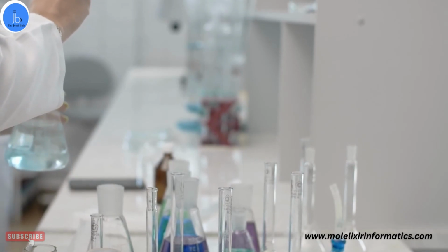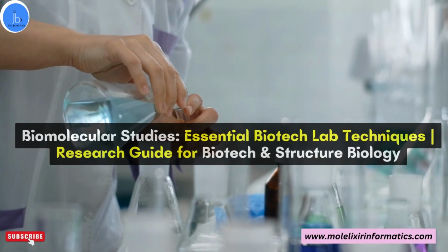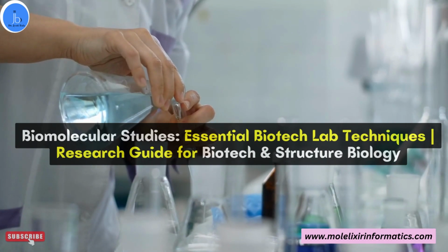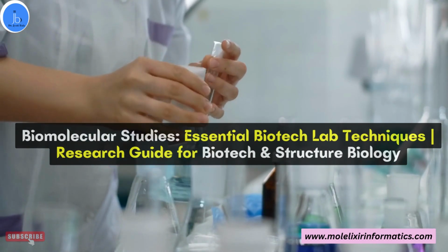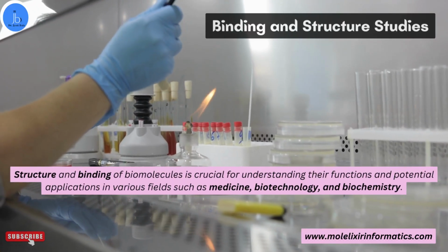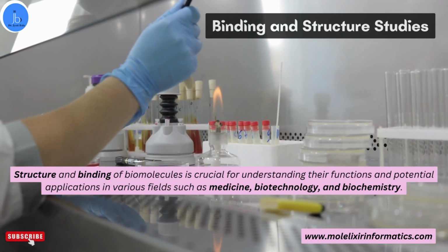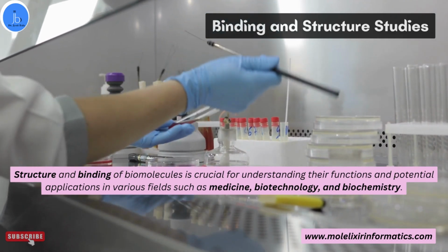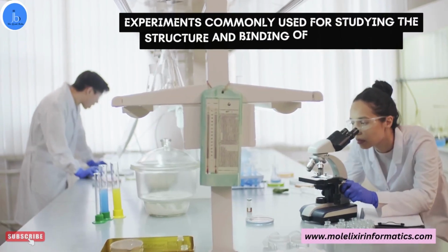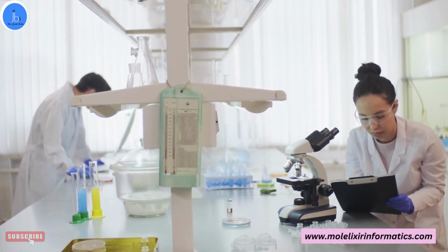In this session, we will be exploring some of the useful lab experiments which are required for structure and binding studies. As we know, studying the structure and the binding of biomolecules is crucial for understanding their function and potential application in various fields such as medicine, biotechnology, and biochemistry. Here are a few of the wet lab experiments commonly used for studying the structure and binding of biomolecules.